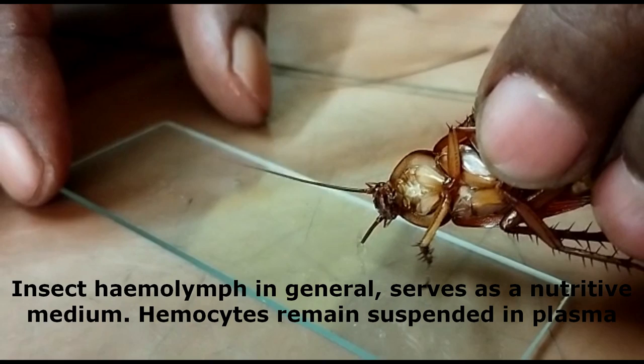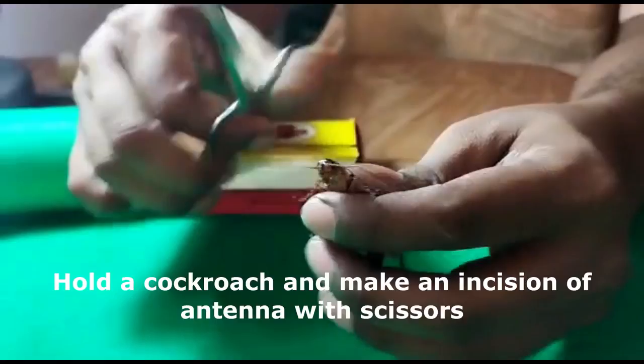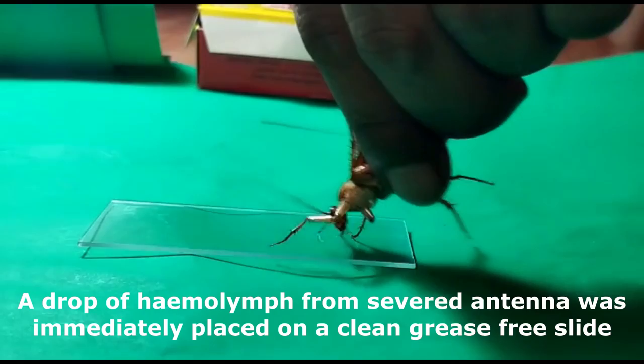Hold a cockroach and make an incision of the antenna with scissors. A drop of hemolymph from the severed antenna was immediately placed on a clean, grease-free slide. Don't breathe on the specimen too hard while collecting hemolymph on the slide.